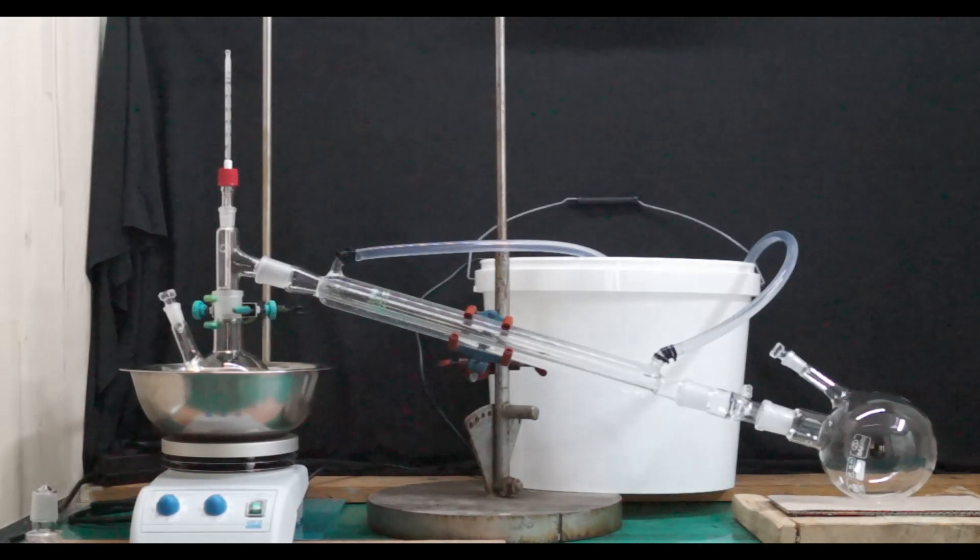The 500 milliliter two-necked flask is put on an oil bath on top of a magnetic stirrer and heater. The side neck is not needed and is closed with a glass stopper. On top of the flask is a three-way adapter with a thermometer.